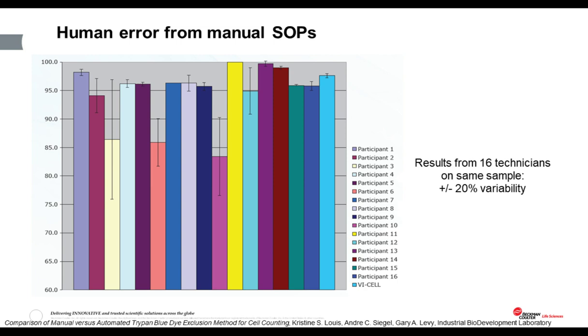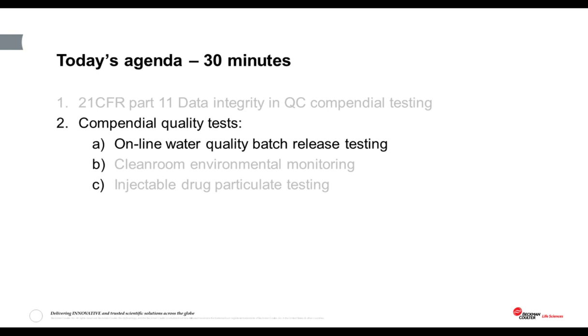Now, whilst the technical specifications of similar instrumentation may appear equivalent, when looking to improve quality control, the QC team should really be looking at the level of automation that the instrument offers to make QC testing more robust and repeatable. For example, a common source of errors in QC testing is sample preparation. So any instrument that automates this process can enhance the reproducibility and the robustness of a QC test.